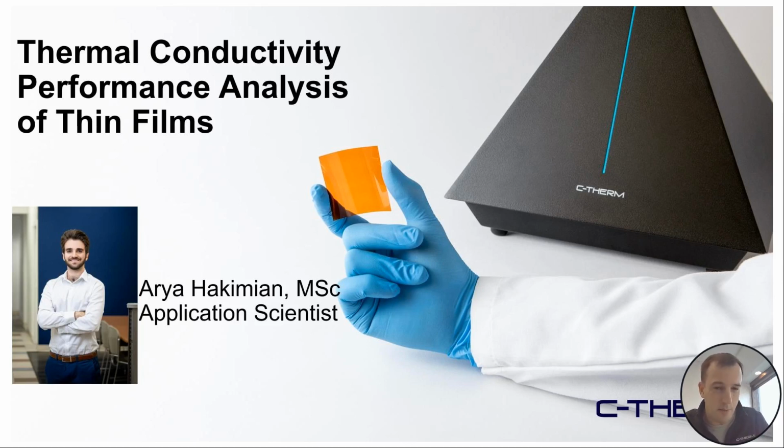We'll be looking at some of the different methods available to characterize thin films, and we'll talk about some of the different aspects of testing them. I'm the warm-up act. I'll be introducing my colleague here, application scientist Arya Hakimian, shortly. He's a specialist in thermal conductivity methods, and brings a tremendous amount of expertise on method selection and an understanding of how the different techniques work. So he'll be walking us through a curated session on testing thin films.